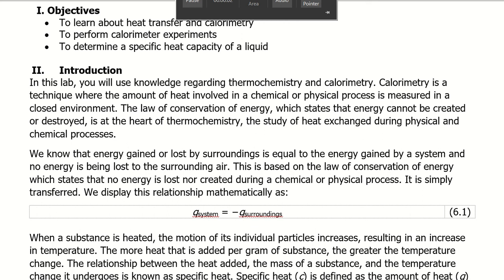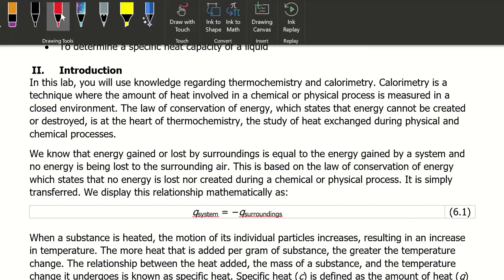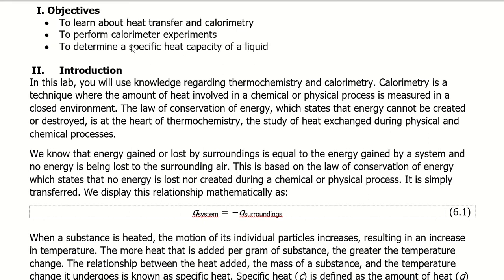Hi everyone. In this video we will be discussing this specific heat and calorimetry lab. In this lab you will learn more about heat transfer and calorimetry, which you've most likely touched on in the lecture material, but you will actually get to perform a calorimeter experiment and also determine the specific heat capacity of a liquid.